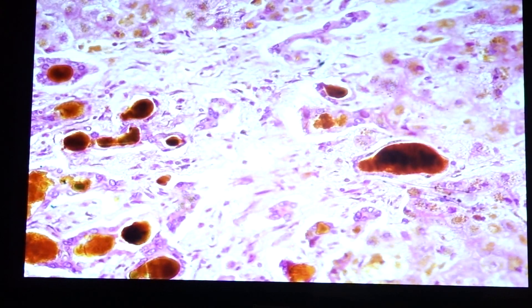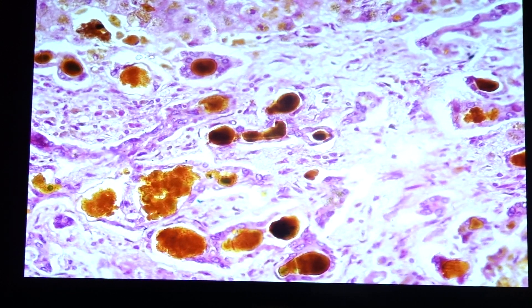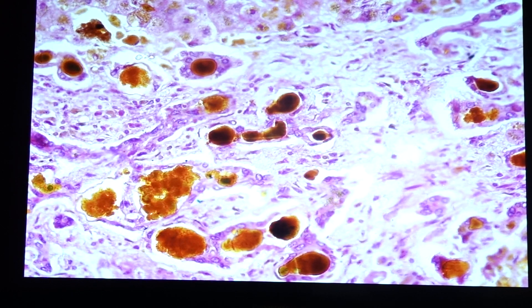Moving to the portal areas, we can see bile ductules that are filled with bile — we call these bile lakes, and the condition is called cholestasis. When we see a lot of bile lakes, we call it cholestasis.